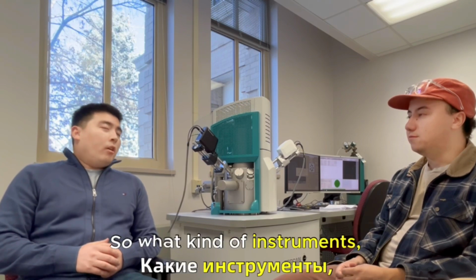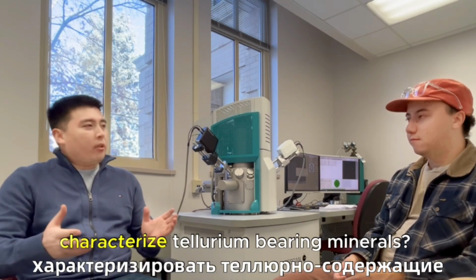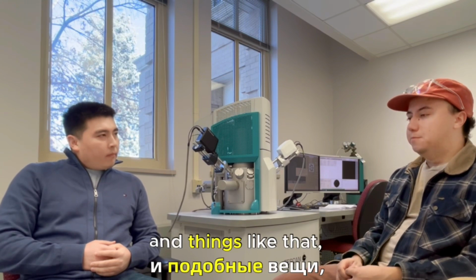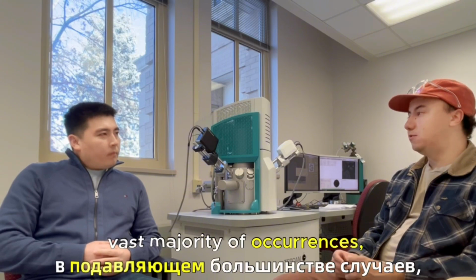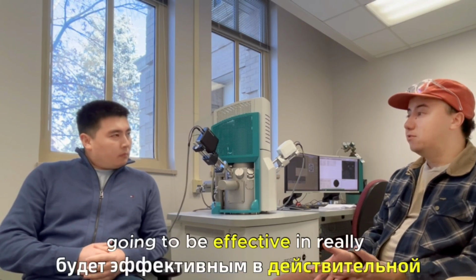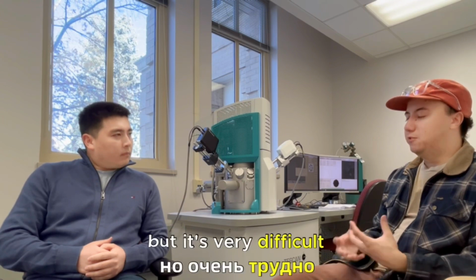Okay, interesting. So what kind of instruments, techniques did you use to characterize tellurium-bearing minerals? Yeah, so tellurides or other tellurium-bearing minerals, like tellurium sulfides, they tend to occur in very small grains, at least in the vast majority of occurrences. They tend to be very, very small. And so traditional petrographic techniques like reflected and transmitted light microscopy are not going to be effective in characterizing the abundance of these grains. You can certainly see them in some cases, but it's very difficult to quantify the occurrence.